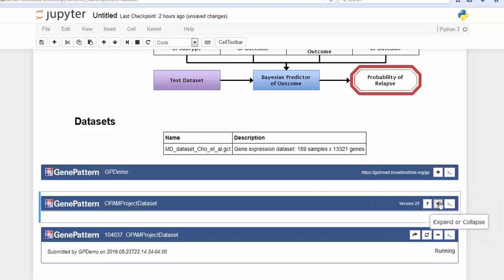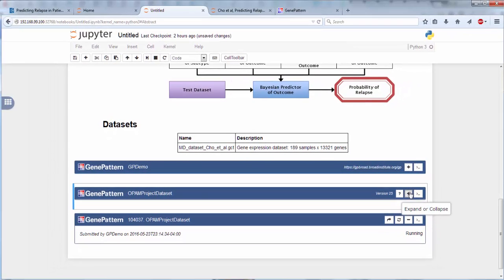Previously, researchers who wanted to include their analyses in a notebook would have had to do so through written code. GenePattern Notebook removes that requirement, providing hundreds of methods for the analysis of genomic data. Once the module has finished running, the results can be sent to other GenePattern cells using the UI, or they can be accessed by programming users via Python, just as you would use any other Jupyter Notebook results. This is another way in which GenePattern analyses integrate seamlessly into the flow of a notebook.